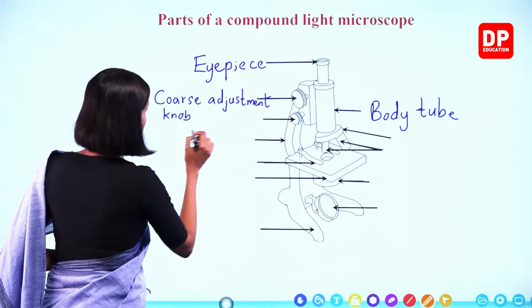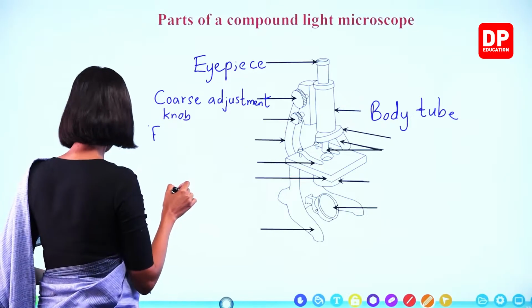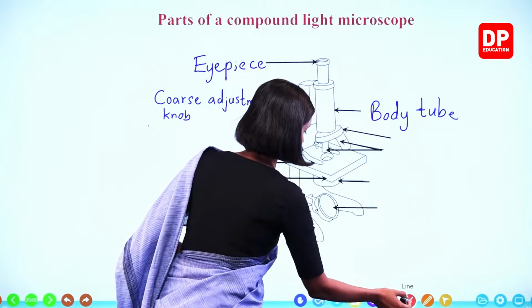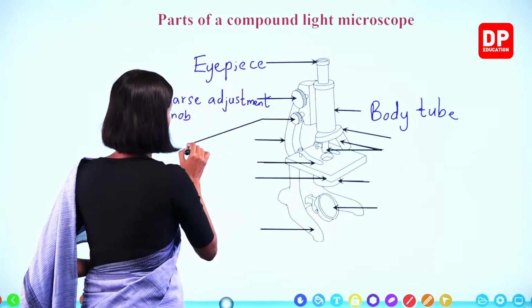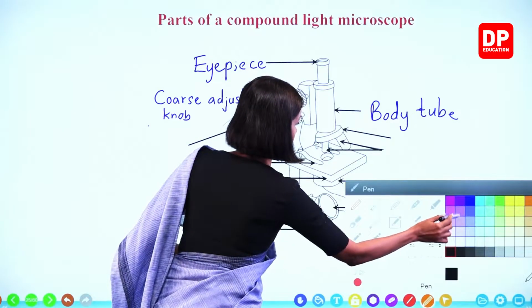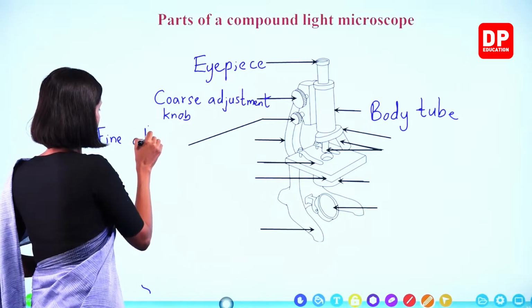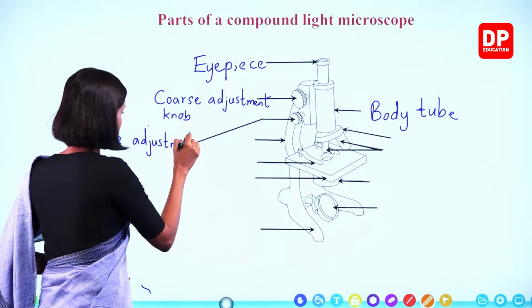And this is the fine adjustment knob. Fine adjustment knob.